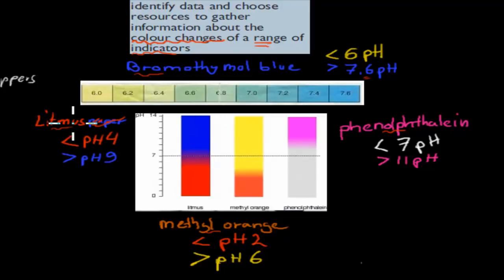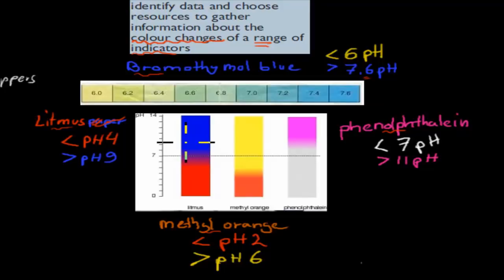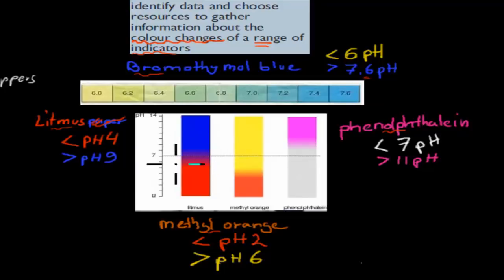Same thing with litmus. A pH of less than 4 would be red. If a pH is higher than 9, it would be blue. Everything in between would be dark purple or reddish blue. So, between 4 and 9, you have that range where you can actually see what kind of pH the substance has. Lower than 4 is red, and higher than 9 is blue.